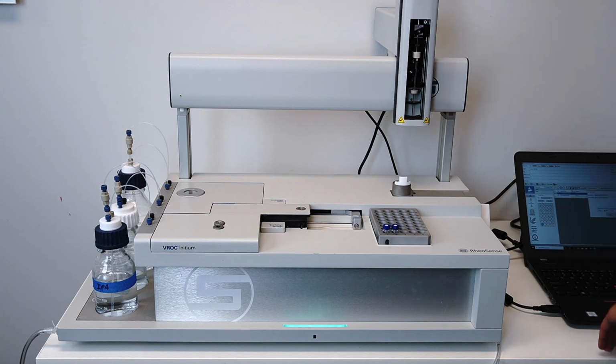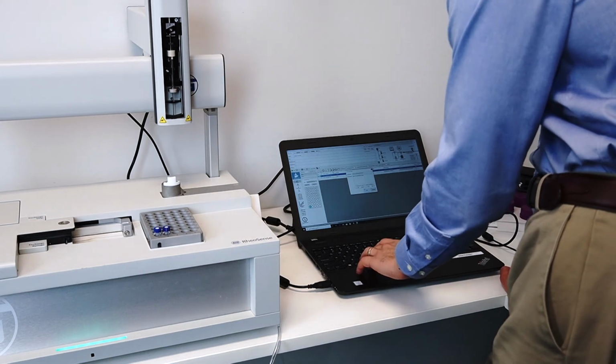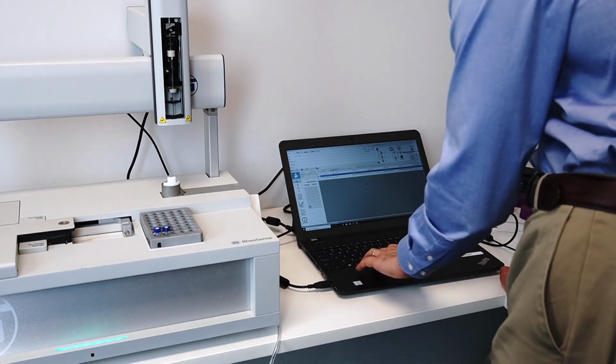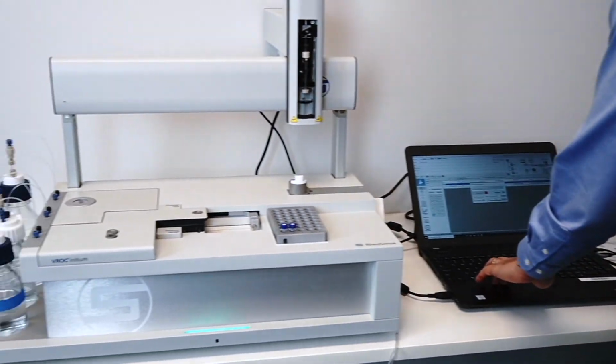Setting up the job now. I'm going to give it a name, demo, and a description, which is just demo, and I'm going to hit OK. And the instrument will then go through some pre-diagnostic tests.